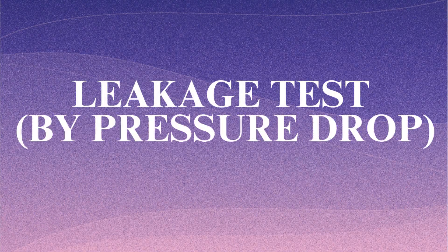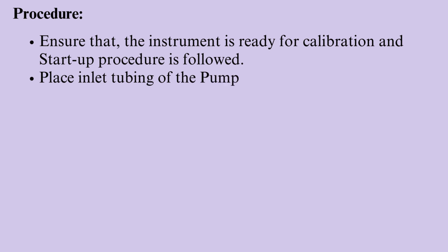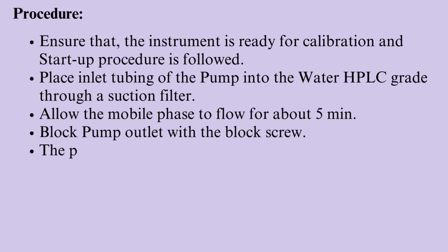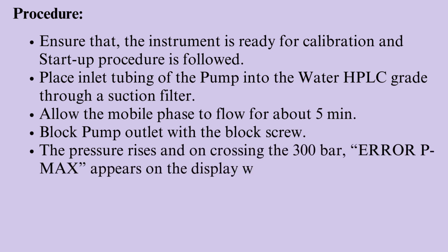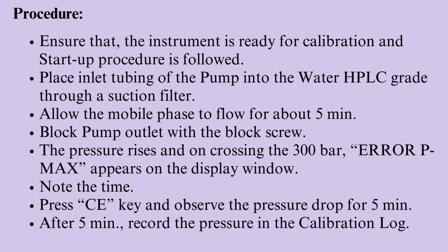Leakage test by pressure drop — procedure: Ensure that the instrument is ready for calibration and startup procedure is followed. Place inlet tubing of the pump into HPLC grade water through a suction filter. Allow the mobile phase to flow for about 5 minutes. Block the pump outlet with the block screw. The pressure rises, and on crossing 300 bar, error PMAX appears on the display window. Note the time. Press CE key and observe the pressure drop for 5 minutes. After 5 minutes, record the pressure in the calibration log.